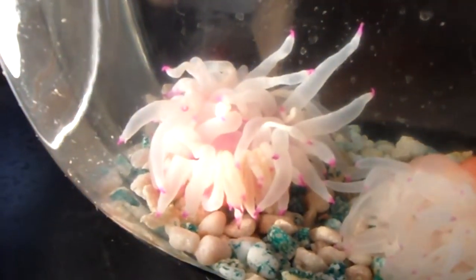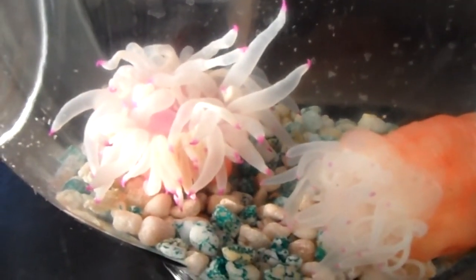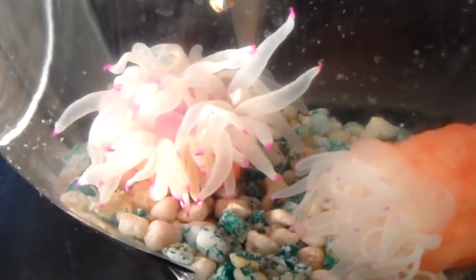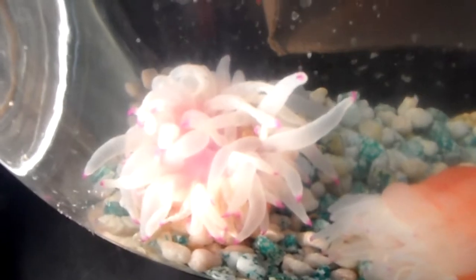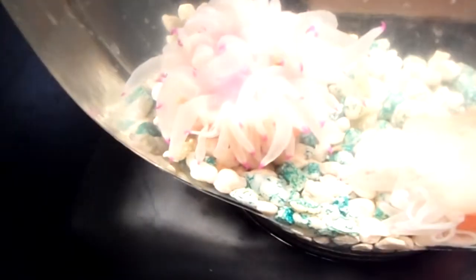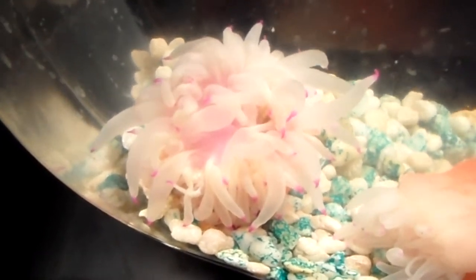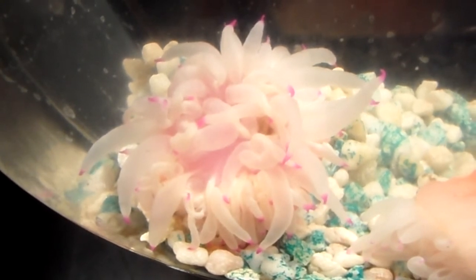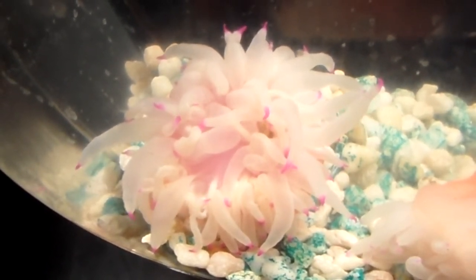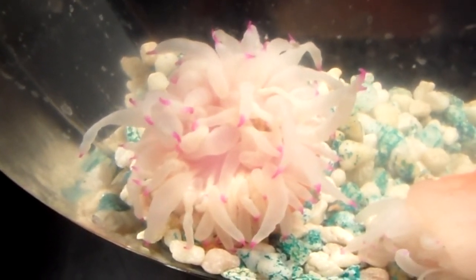Notice how the tentacles have shriveled up a little bit as a result of the vinegar. Like I said, hopefully that won't affect our feeding experiment. So there's the brine shrimp, or shrimp pellet, sorry. I'm going to pick the light back up again so we get a well lit and happy anemone. Once again, we're seeing a reaction.